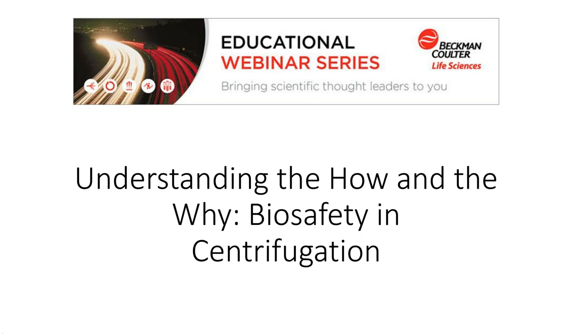I am having trouble getting small pieces of hay, approximately 1 millimeter ground, to form a solid pellet in water. Do you recommend increasing the time or the force first when coming up with new centrifuging conditions?